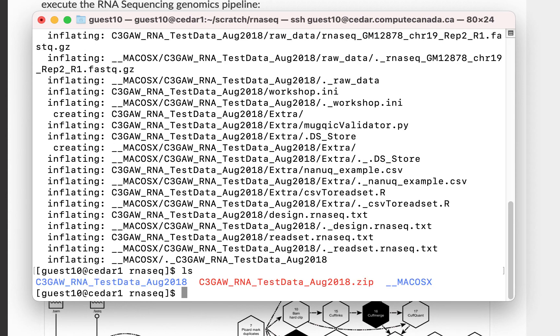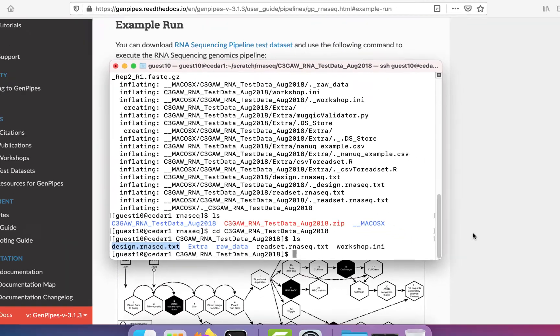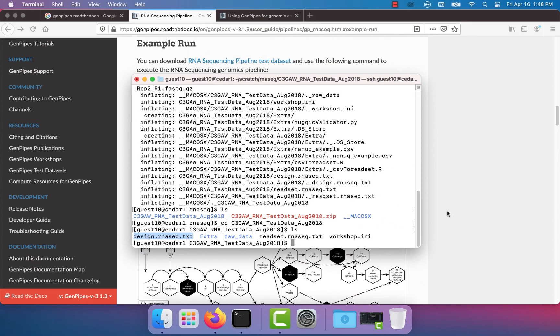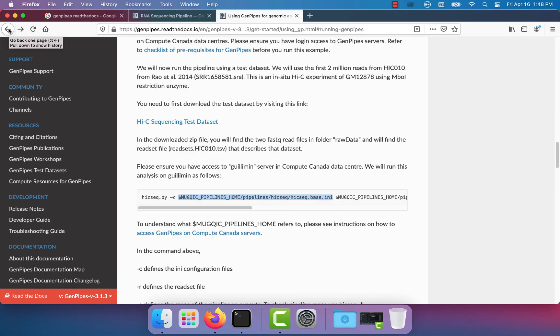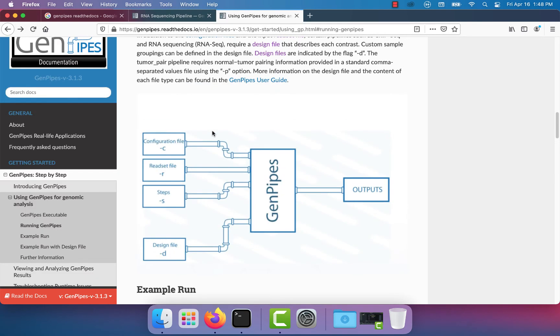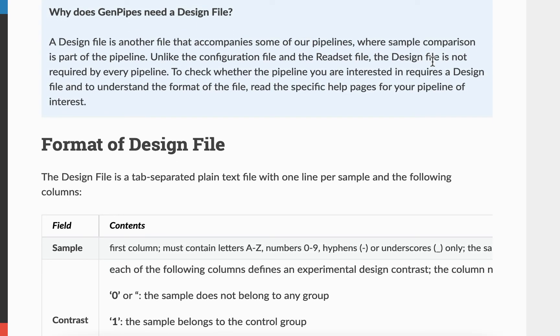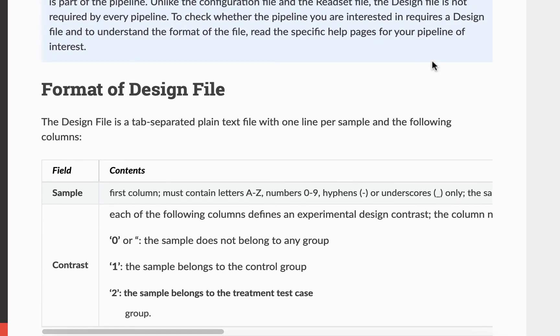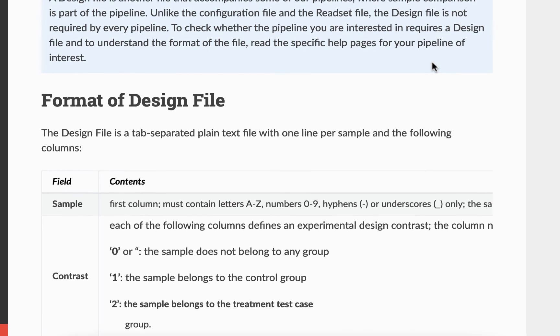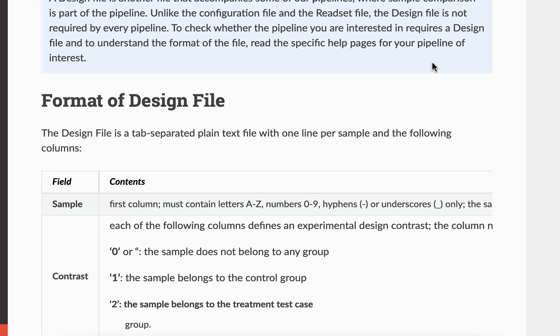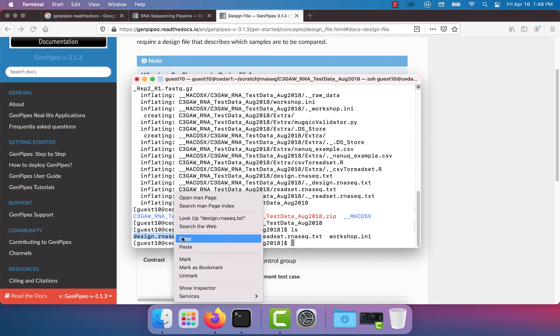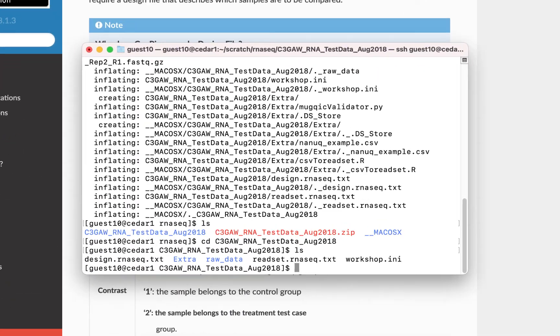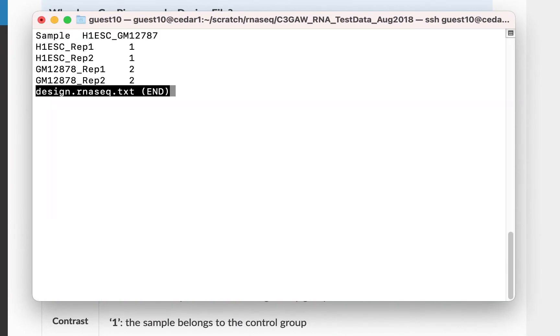Now, let's go inside the data directory. Let's have a look at the design file. You must specify the exact sample name in the first column and contrasts in the other columns. Control groups can be specified with the digit 1 and treatment groups marked with 2. You can have any number of contrasts you like. This is how an actual design file looks like.